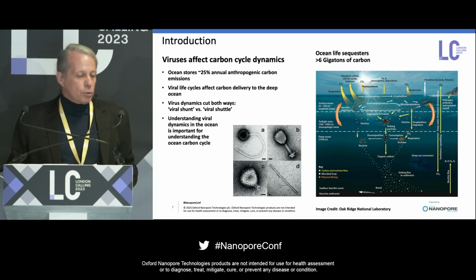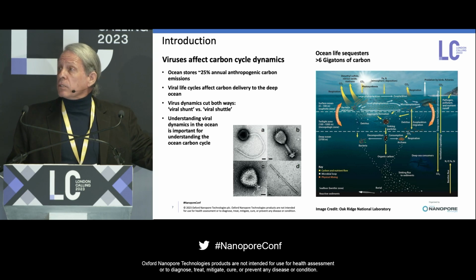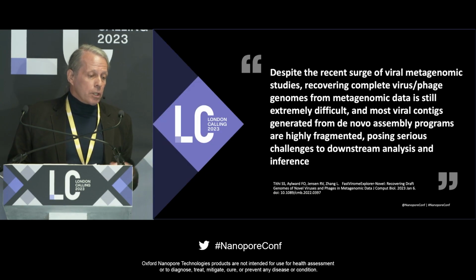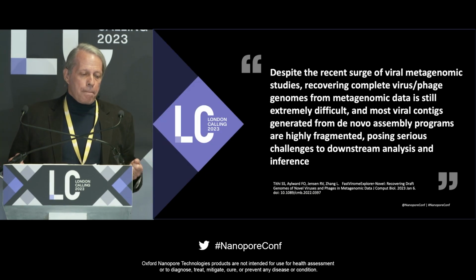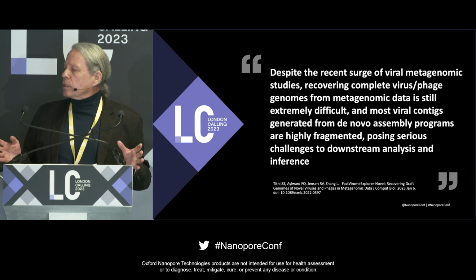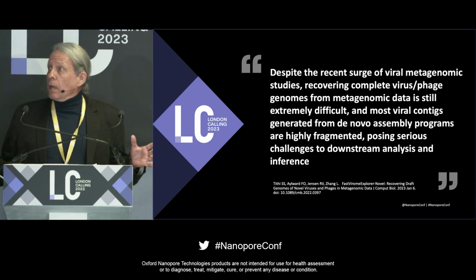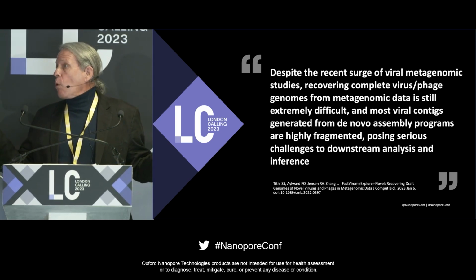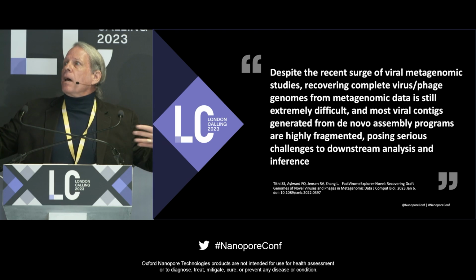These little fellows you see here are actually from some of our concentrated samples, individual bacteriophage that we've sequenced genomes of using the approach. Now, the challenge, of course, in trying to get viral genomes using shotgun metagenomic approaches is, as we've heard before and we'll hear for a while, assembly.